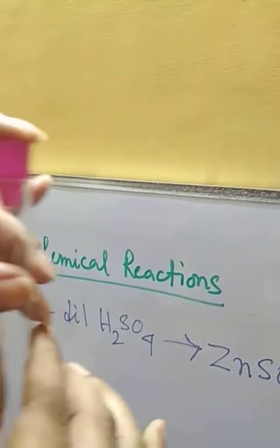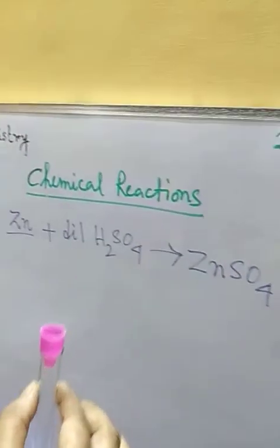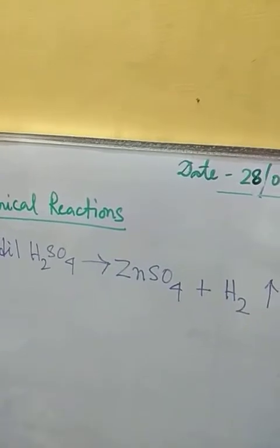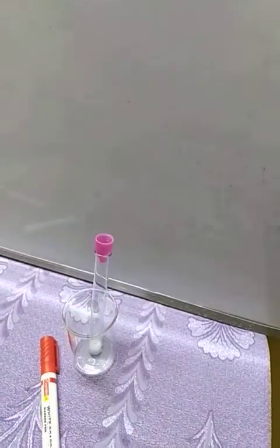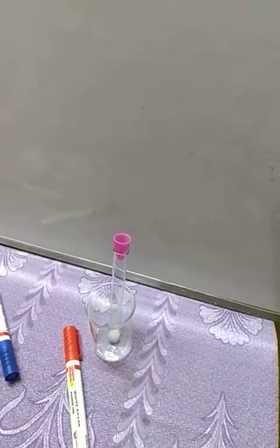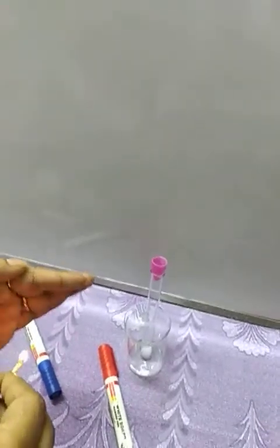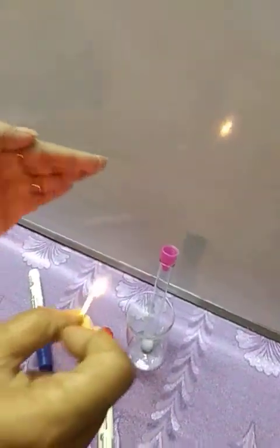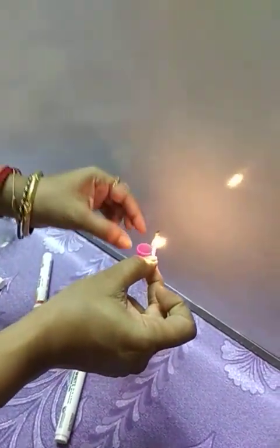Okay, now slowly I'm using this to keep the test tube, and here I will be lighting a matchstick. You have to be very careful. If you do this reaction at home, you have to be very careful. So I will take out the cap and keep the matchstick here.